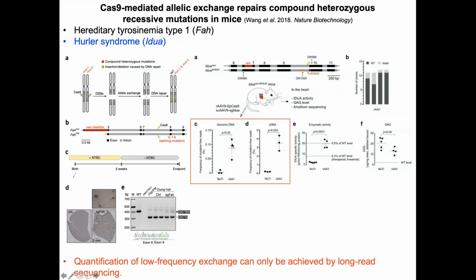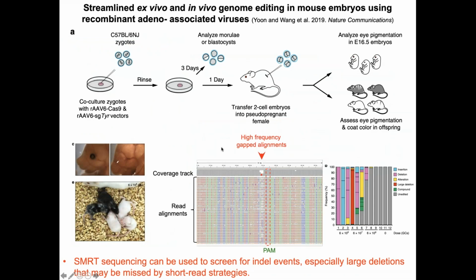You may imagine that this is very, very low. However, it's still enough to reverse the phenotype. And without these methodologies developed for long-read sequencing, these types of inquiries for gene editing events are not achievable.